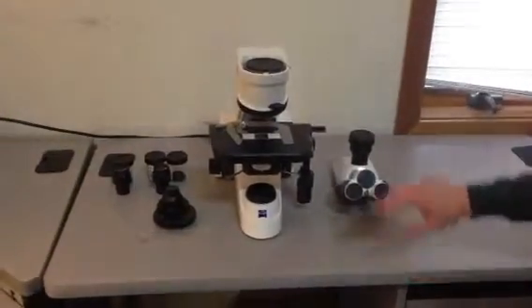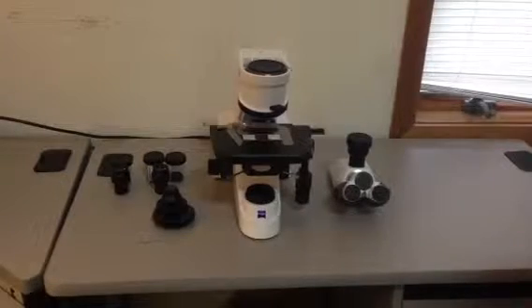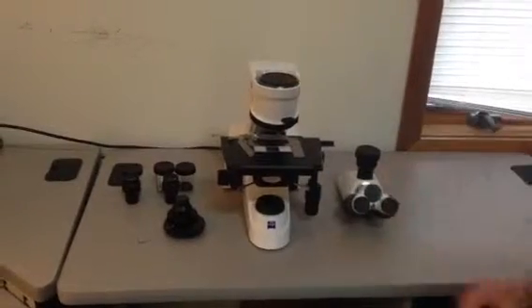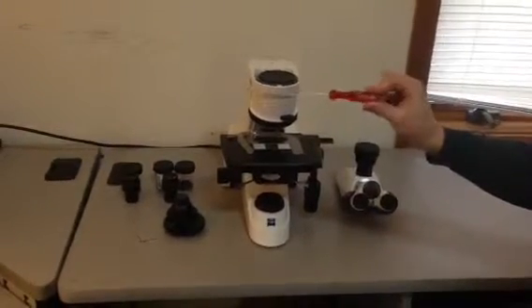We're going to install this Axialab microscope. It's all laid out on the bench, how it should look when you unpack it. The first thing we're going to do is install the head onto the microscope stand. For everything we're going to do, you just need one tool — a 3mm Allen wrench.